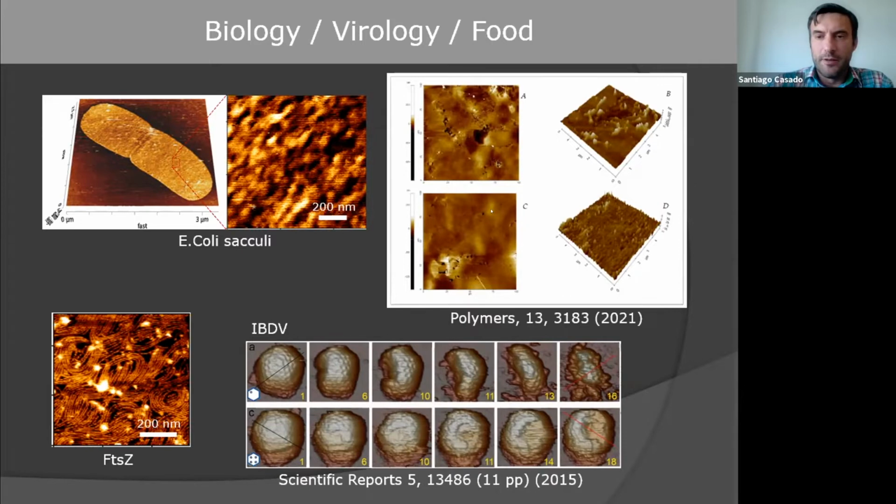Here in the upper right part, I'm showing one of the few results that I have obtained so far at the Universidad Tecnica de Ambato. It was made completely in this lab. It is a film made from banana. Trying to reuse the waste of this material, we can make some edible films, and some of them were more breakable than others. How can we measure that? By measuring the surface with AFM, we can see that one has some holes on it, and the other one has fewer. So probably this is the reason for the elastic properties, plastic properties, I would say.